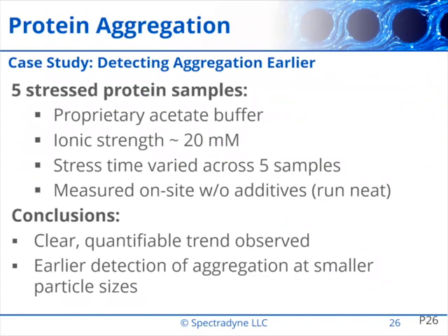We measured on site, as I mentioned, without any additives. So we didn't add any liquid or conductivity or surfactant. We run neat. The conclusions we can draw from this measurement are a very clear quantifiable trend in aggregation as stress time increased. And we'll show you that earlier detection of the aggregation is really powerful and probably will be able to save people time and money.